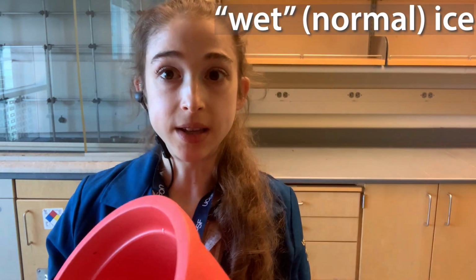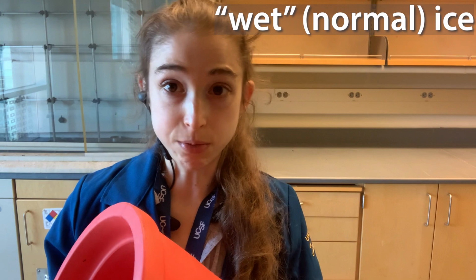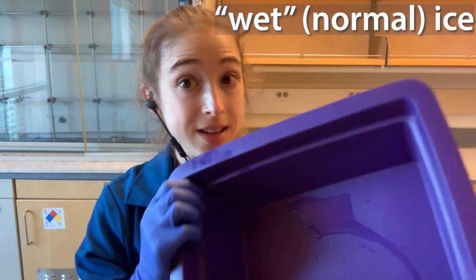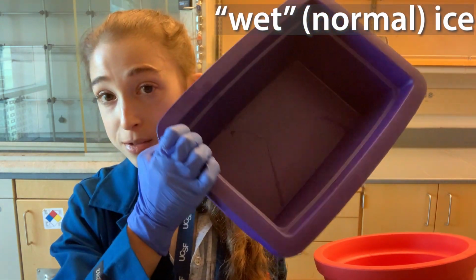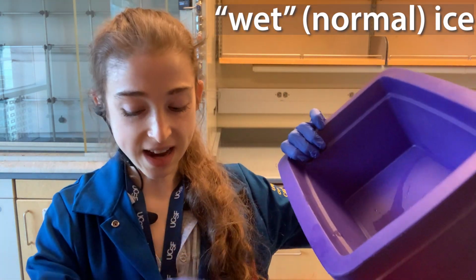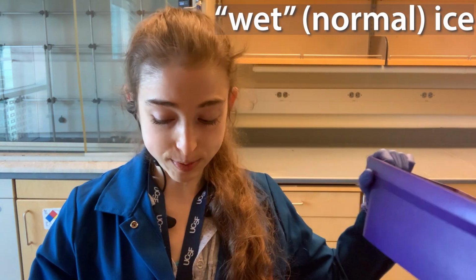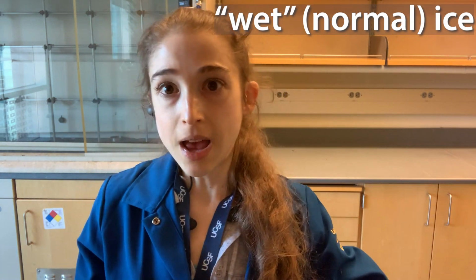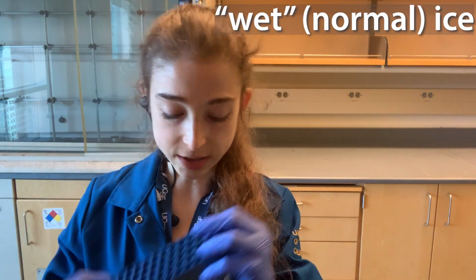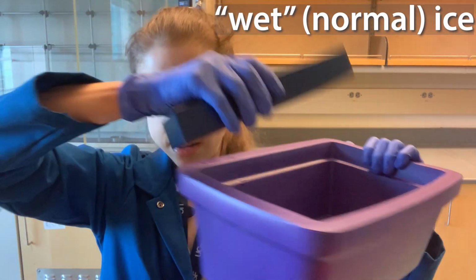But anyway, we can then put the ice in whatever containers we want. Most commonly you'll see a bucket like this. I really like the rectangular ones. These are really helpful to lay things out better, I've found, especially if you want to use some sort of really cool thing, like one of these cool blocks that I'll get to in a second, because it'll fit really nicely in one of these.